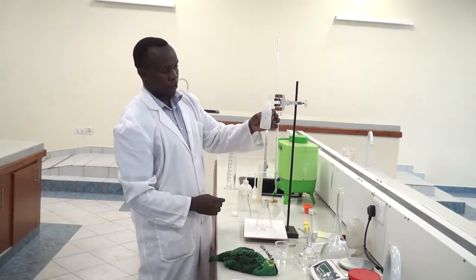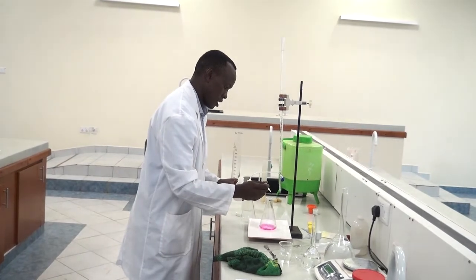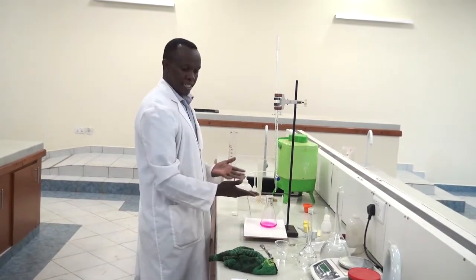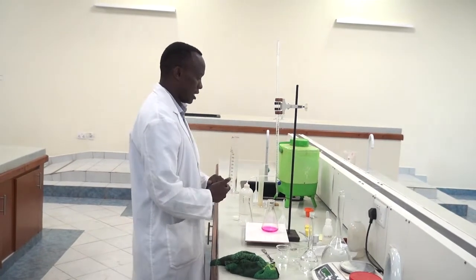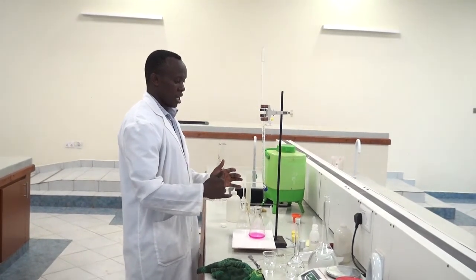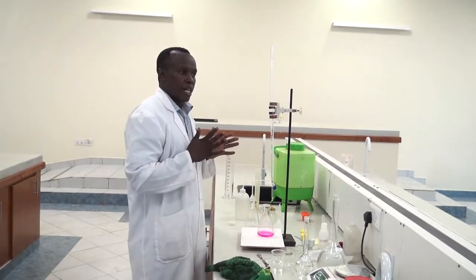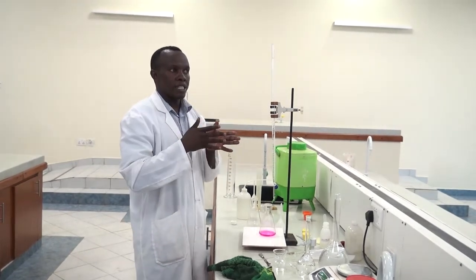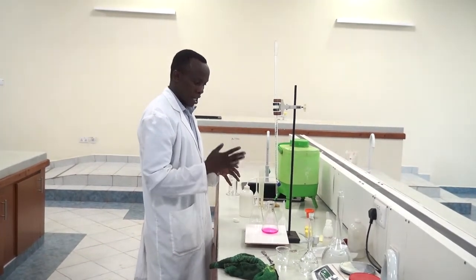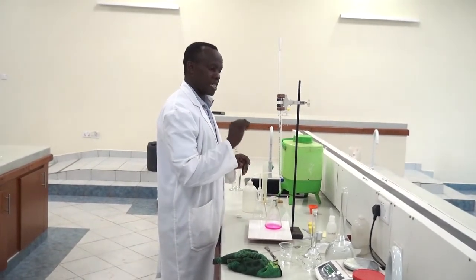I add my phenolphthalein indicator here, 2 drops. Phenolphthalein indicator in a base has a pink color. When I'm doing the titration, I'll titrate until I'm reaching towards equivalence, with an equal amount of the acid nearing an equal amount of the base that I'm using. I'll have the color start disappearing, and from there I'll add drop by drop so that I know the exact endpoint.